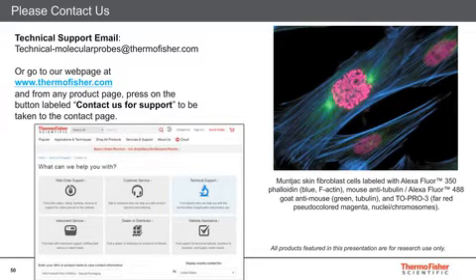So I got to where I was using the signal enhancer solution, which I helped develop, by the way, in R&D, with pretty much every immunocytochemistry and immunohistochemistry protocol I did. It never inhibited binding, and it always seemed to help with pretty much every dye.